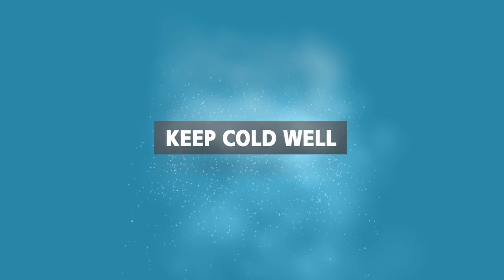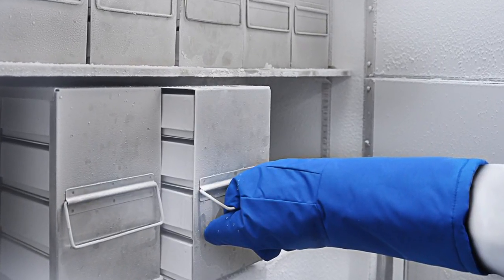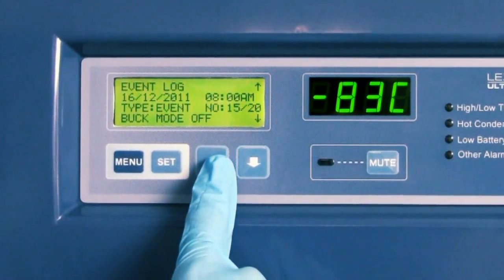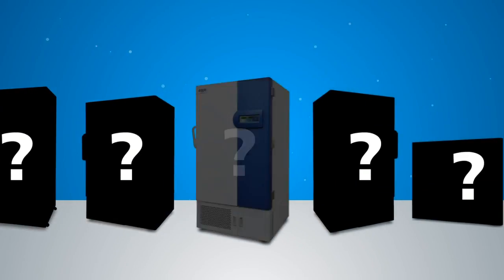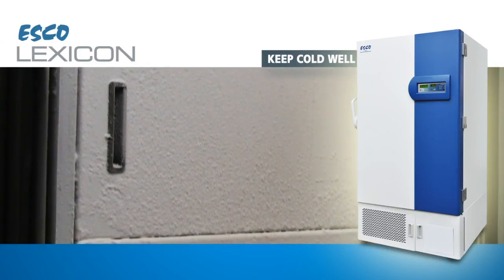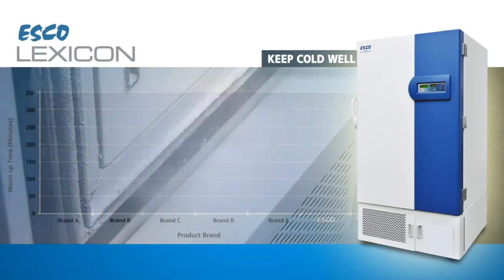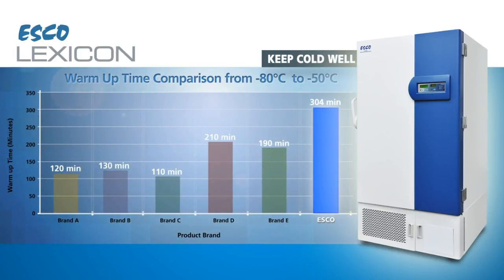Keep cold well. An ultra-low temperature freezer's sole responsibility is to keep precious samples frozen at negative 80 degrees Celsius. You can spot a good freezer from average ones by the following: the freezer can keep cold for a longer time when power is cut. A Lexicon freezer like me could easily buy you twice the time compared to the average performer.